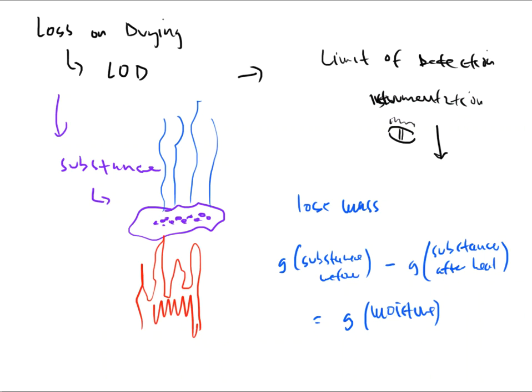Okay, so another thing that I need to mention here, this flame that we use to heat, we don't really use a flame. Okay, so what we will do is we will put this substance into an oven. So these samples that you will be measuring today will be weighed, and then you will place them in an oven, and you will allow the oven to heat. Think of it as the oven at home in your kitchen. You're baking a cake for us today. Okay, so it doesn't get more complicated than that.